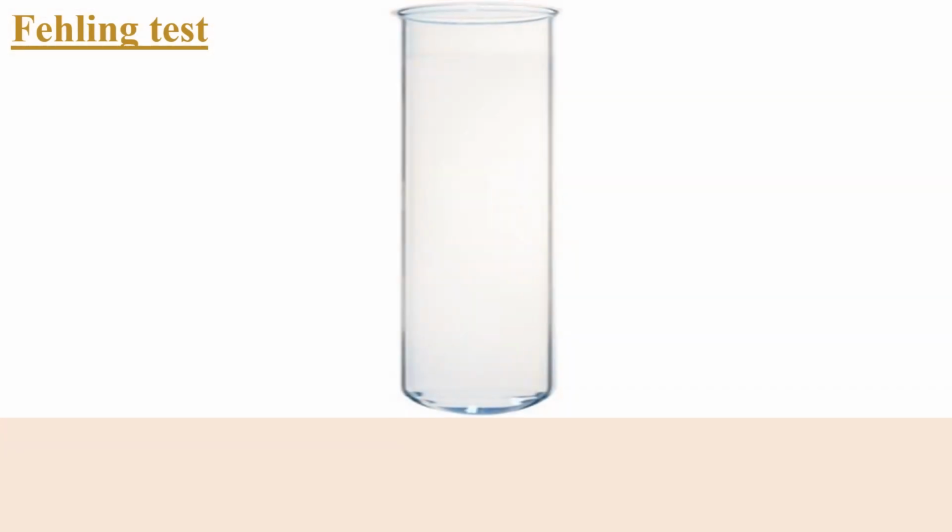The second test is the Fehling test. We're still dealing with carbohydrates. The aim of this test is to identify the presence of reducing sugars. Reducing sugars are maltose and glucose. We said that in starch digestion, starch is broken down into maltose, a double sugar, and then into glucose, a simple sugar. Starch has its own test, the iodine test. But maltose and glucose are called reducing sugars because they give a positive result with the Fehling test.